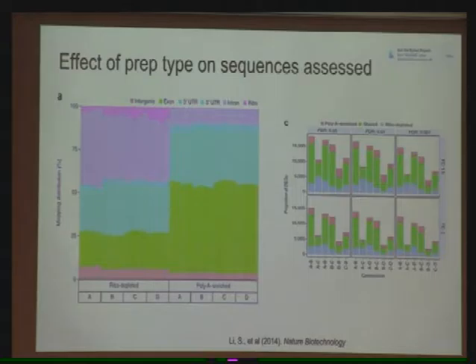If you have a limited budget and you start with not a lot of reads, for example, and then you lose about 10% of them to mapping, and then you lose about another 75% of them because they don't cover the exons that you're interested in, then the actual amount of reads that you have to contribute to quantitating those genes is pretty low.